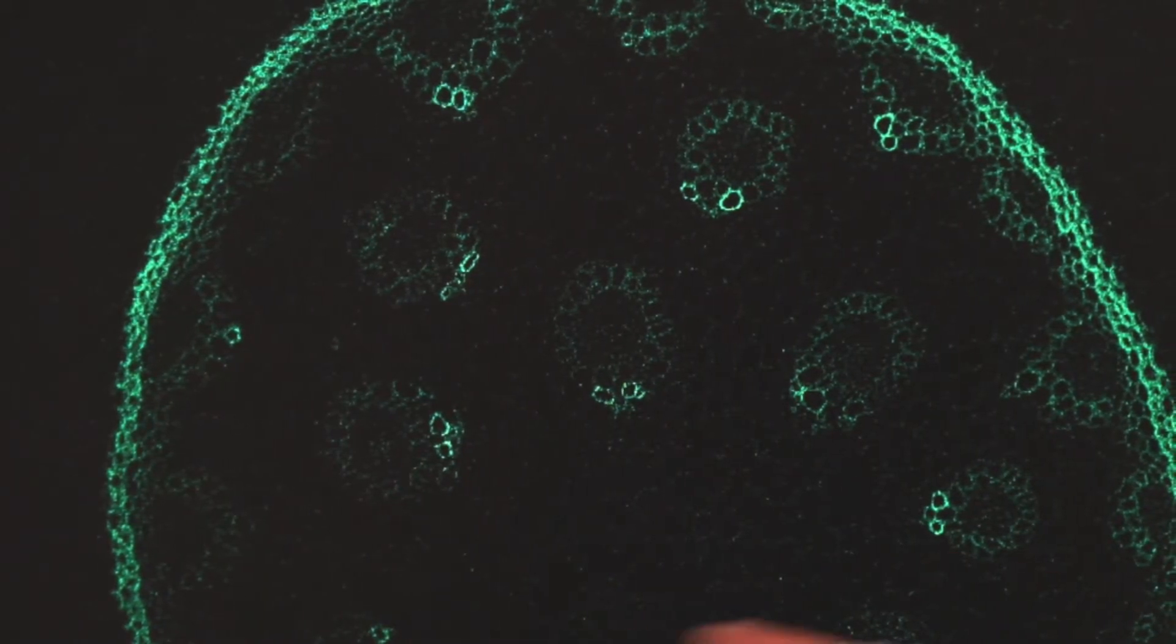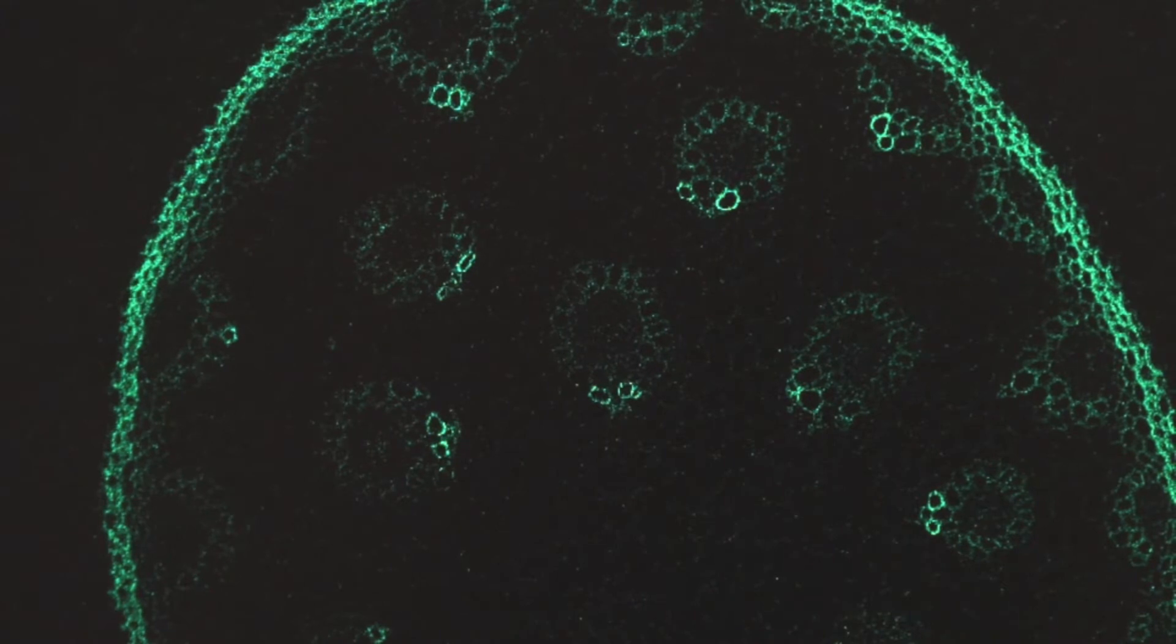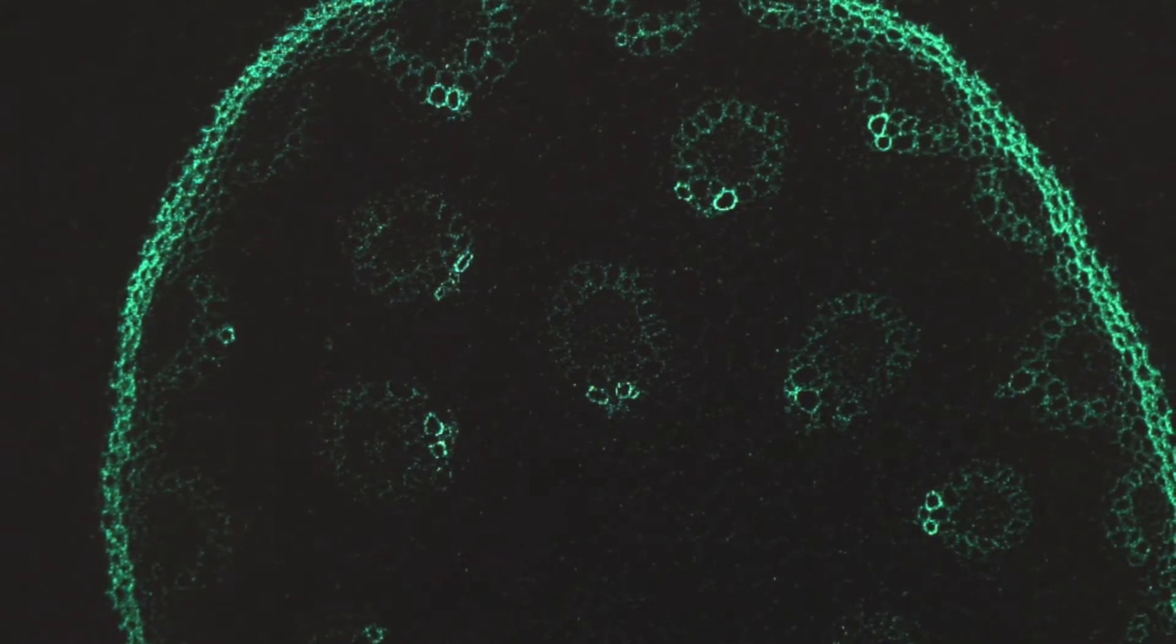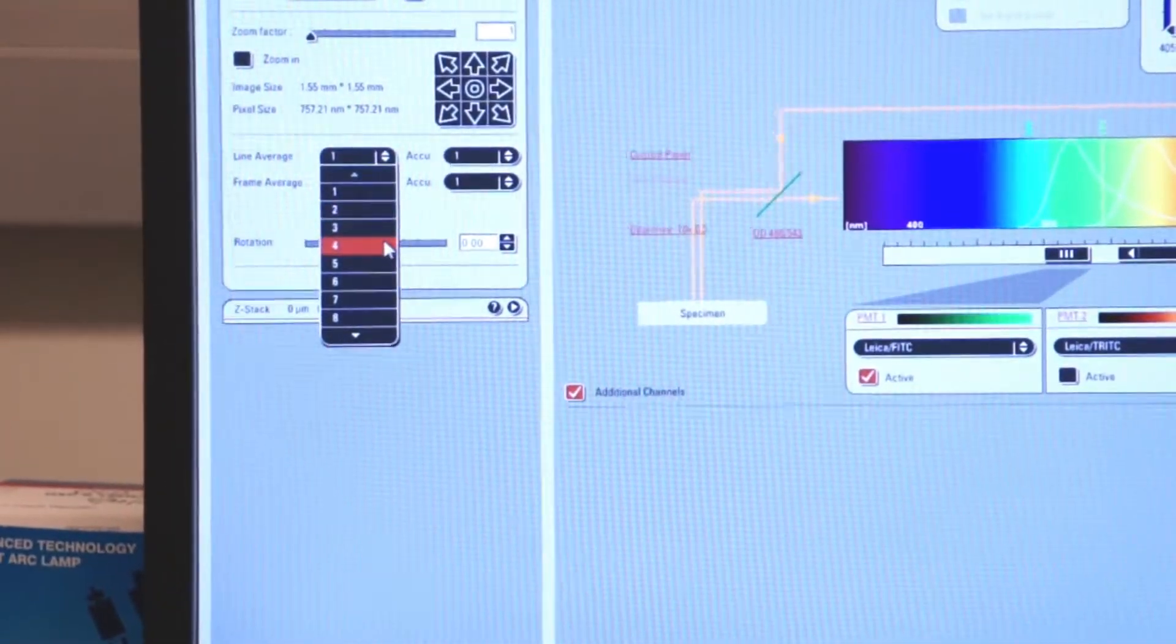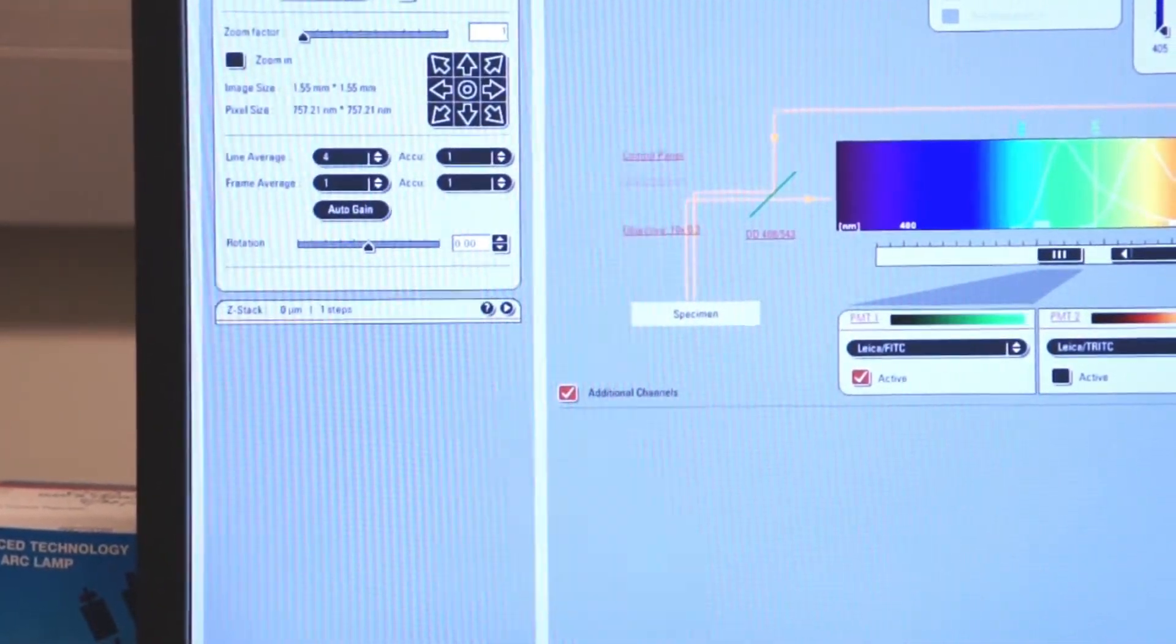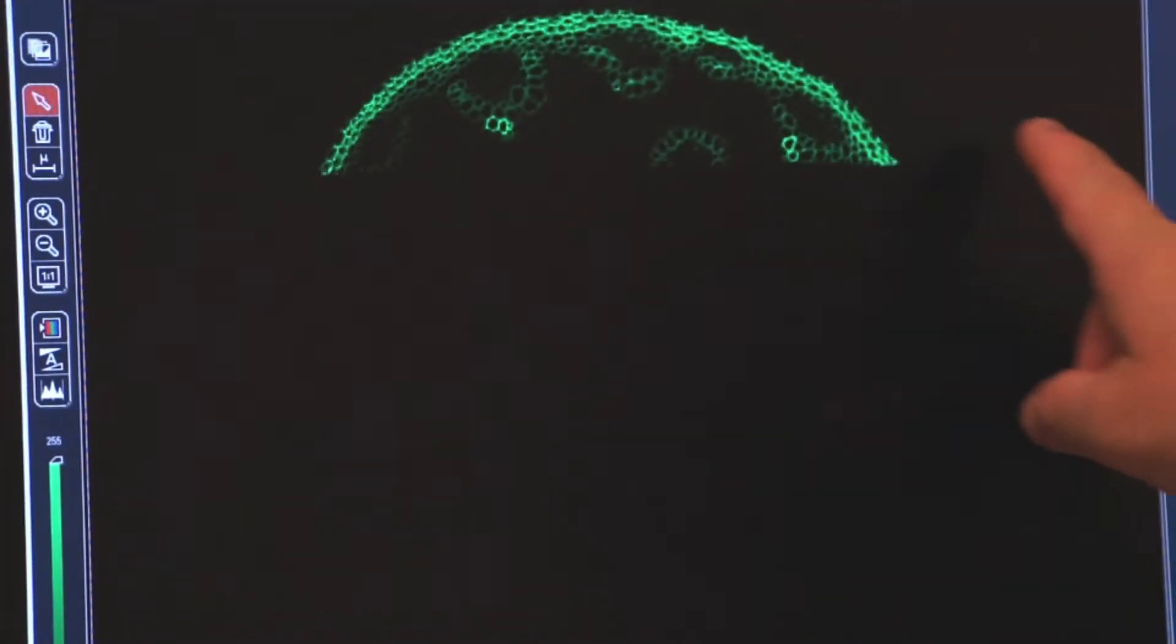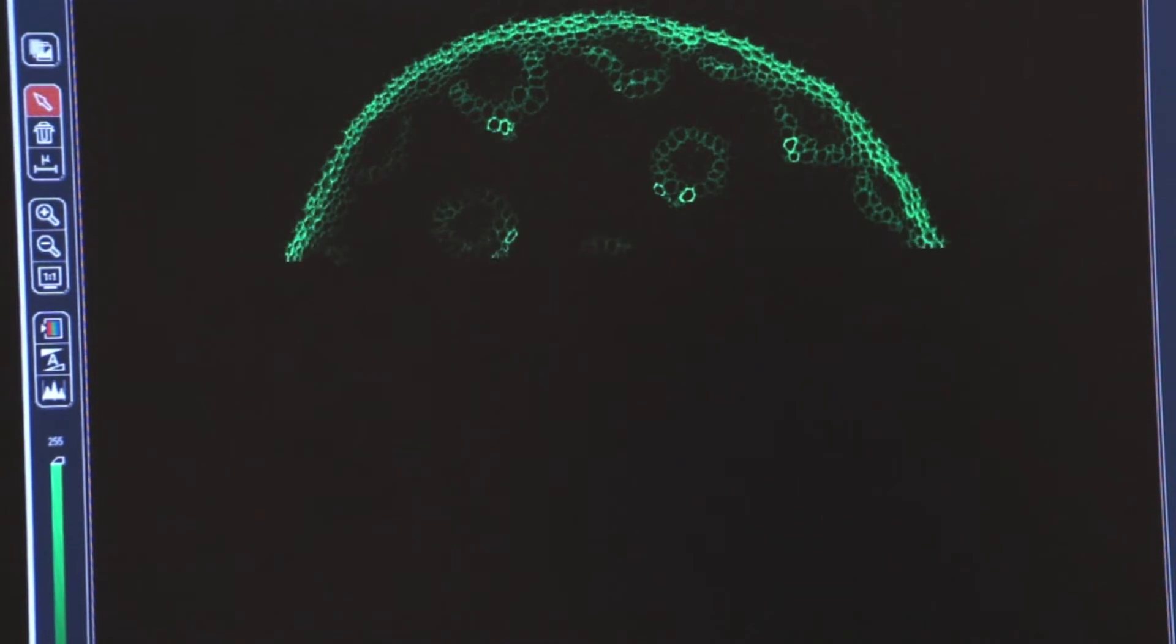Again, to eliminate the noise, I would use line average or frame average. So let's select a line average of 4 and we'll reshoot our image, averaging each line with 4 scans. Now you can see it's significantly slower, but look at how I've eliminated a lot of the noise from my image.